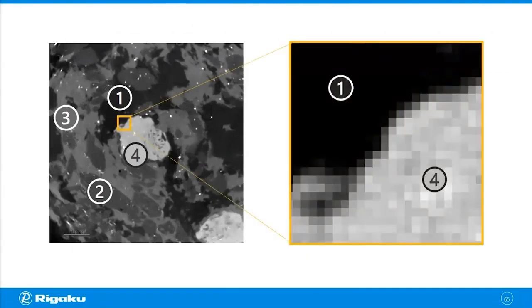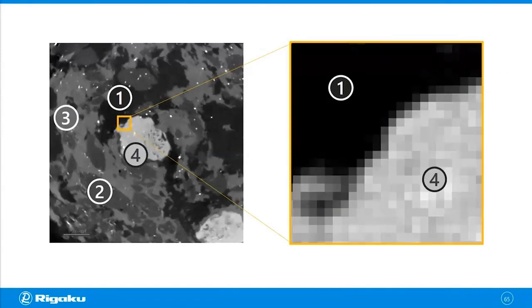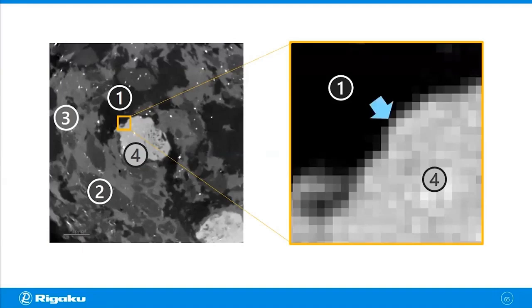So this is an interface of phases one and four. There is nothing in between, but there are intermediate gray level pixels in between because of the partial volume effect.